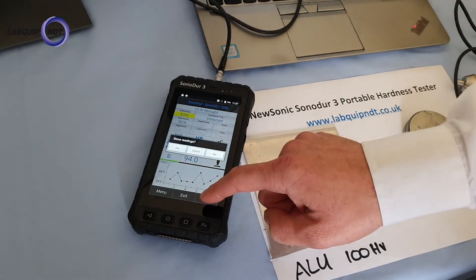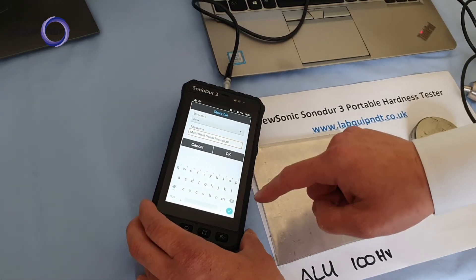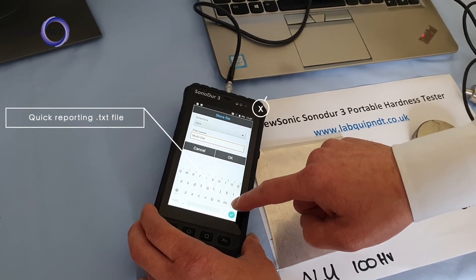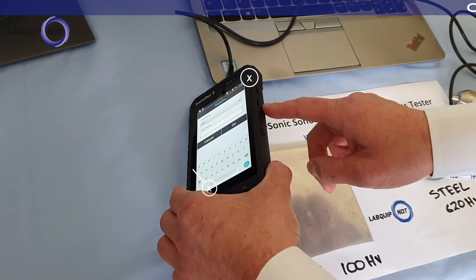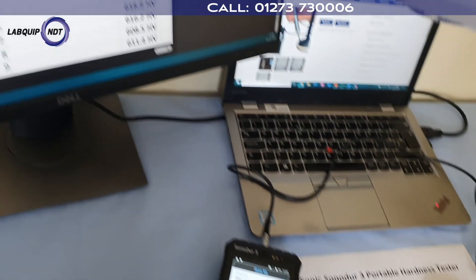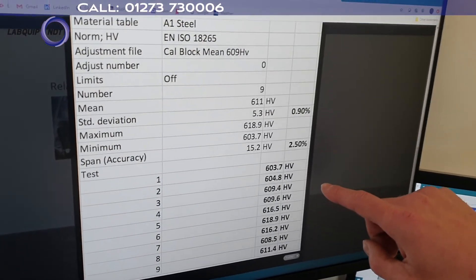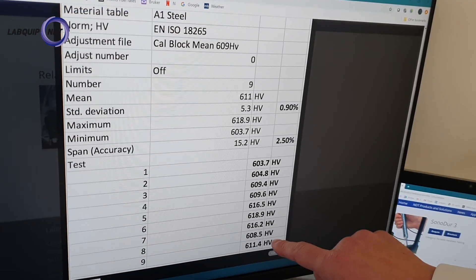Once we've got our test results done we can store the readings on the device. We can rename it whatever we want, and then we can transport it via USB or Bluetooth directly onto our laptop or PC. This is such an example of a report — you can see the results, and that's taken off as a text file or Excel file.